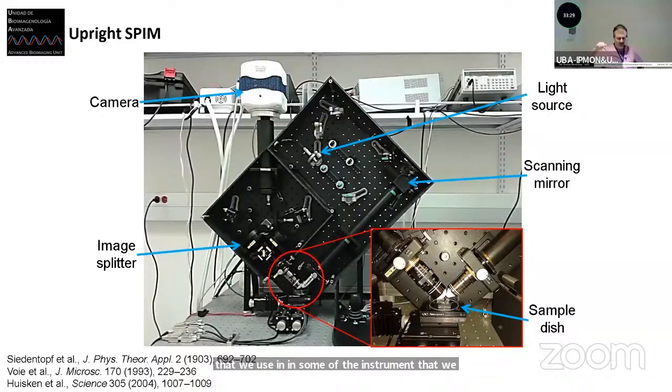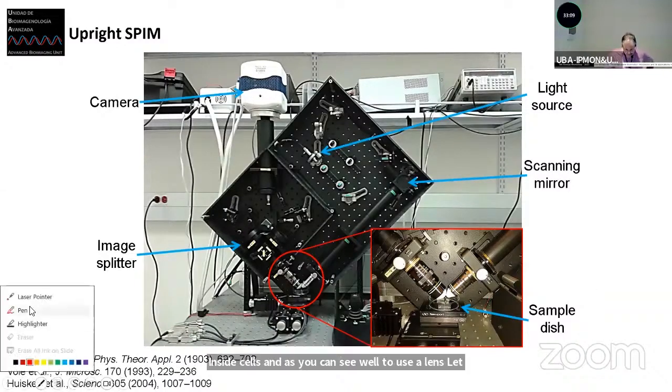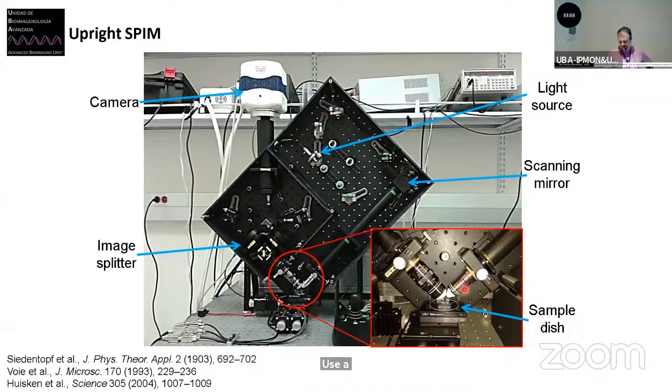So when I joined the LFD, Nick Hede, another postdoc, had built this light sheet, which is an upright L configuration for the light sheet. And he was using this instrument to do correlations inside cells. And as you can see, he used a lens with low numerical aperture, probably 10 or 20x, and 0.3, 0.4, something like that, in the excitation, and then a very big lens in the emission in order to have a PSF that enabled him to do fluctuations. So this was a 20x with 1.1 numerical aperture.